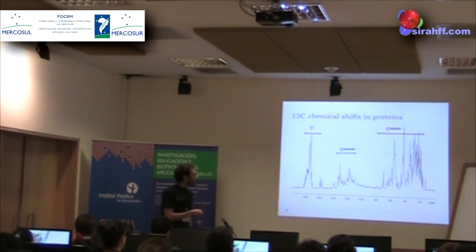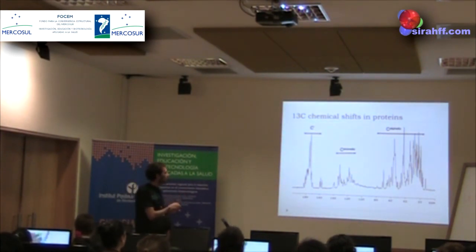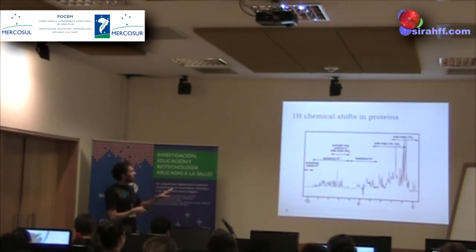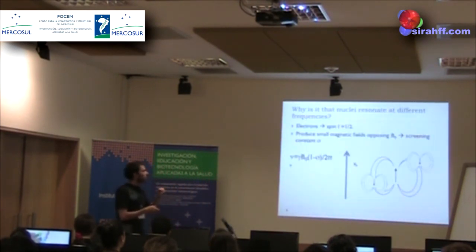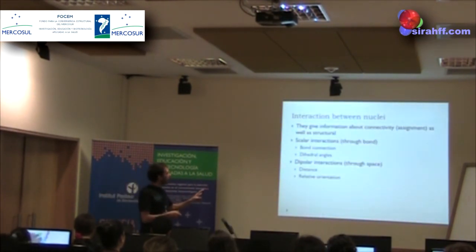So aliphatic carbons are essentially different. You can work with them separately in spectra. You can separate spectroscopically aliphatic carbon from aromatic carbon and carbonyl carbon. So that's the characteristic of the chemical shift. You get the frequency which is given by its chemical environment. That's all.